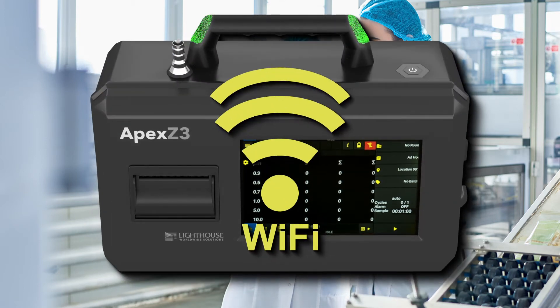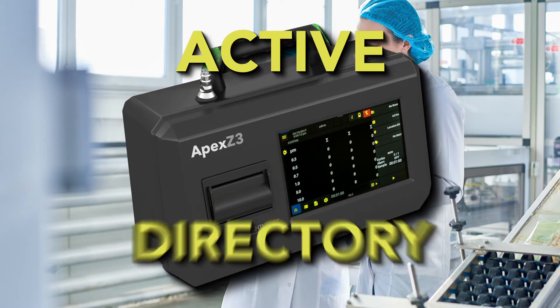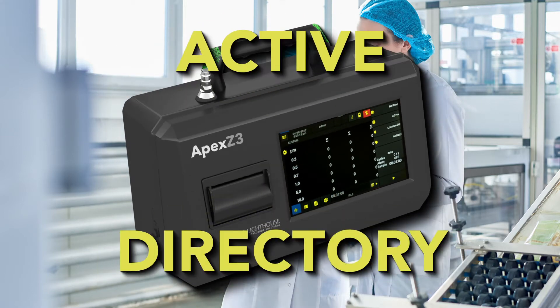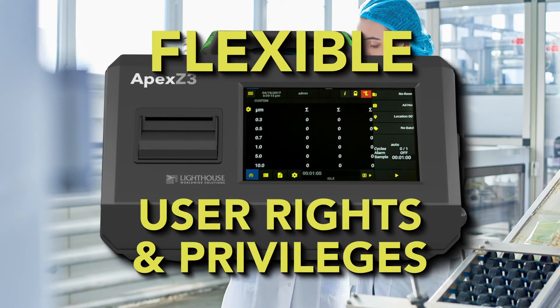Wi-Fi enabled means you can easily connect to your network and upload your cleanroom data. With Active Directory, you can link existing employee credentials to multiple units without having to load usernames and security access. Active Directory Groups also gives your IT administrators more flexibility with user rights and privileges.